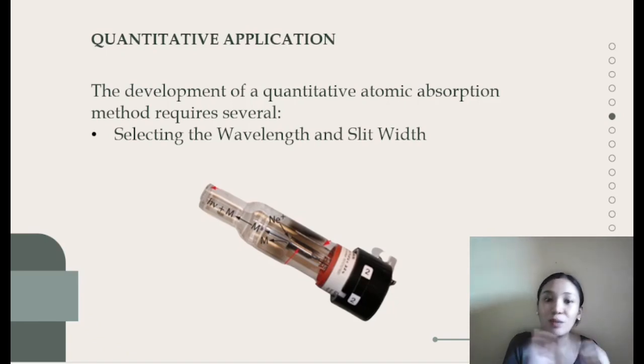In line with that, we are going to select an apparatus that is narrower than that atomic absorption line. And why do we need to use a narrower one? It is because if we continue utilizing continuous radiation sources, it is difficult for us to detect absorption, which results from incident radiation at all.